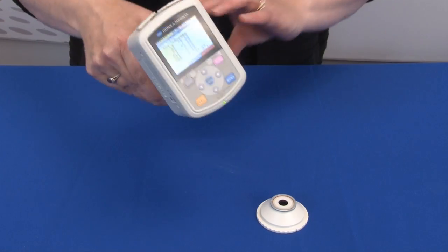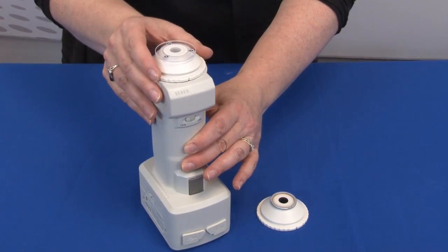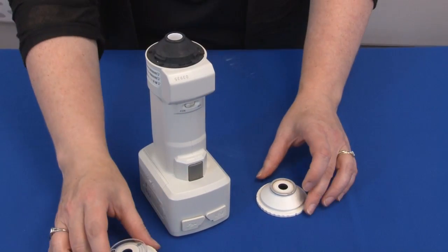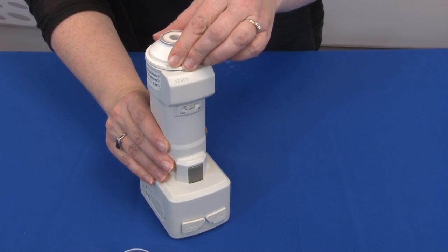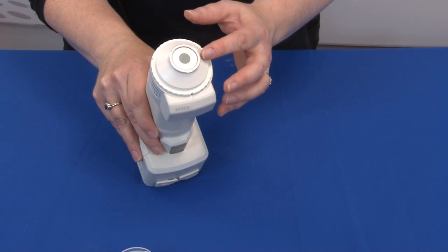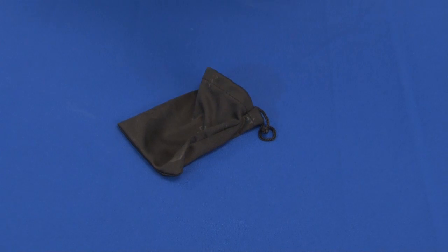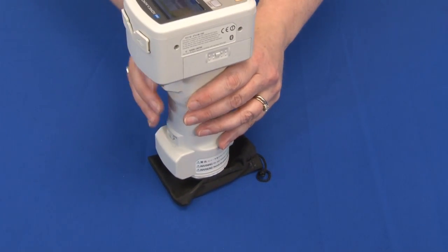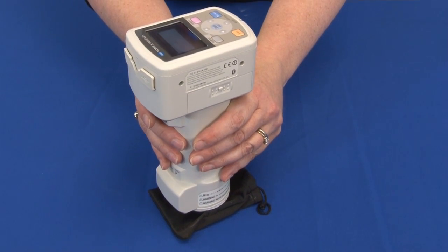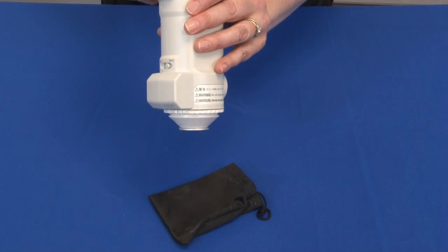The target mask with glass is a useful accessory to have when measuring powders and wet surfaces. The protection glass plate prevents the specimen from damaging the instrument. This target mask also ensures specimens such as textiles are perfectly flat when measurements are taken, as it can flatten soft sample forms.